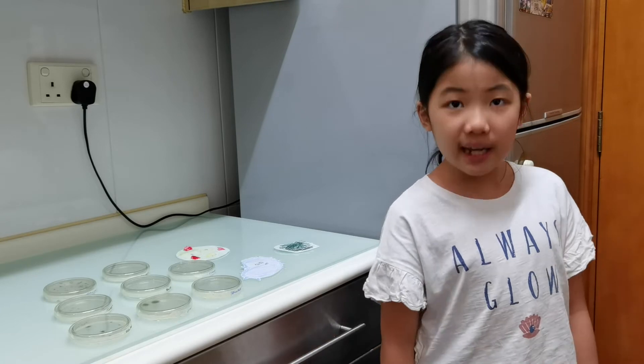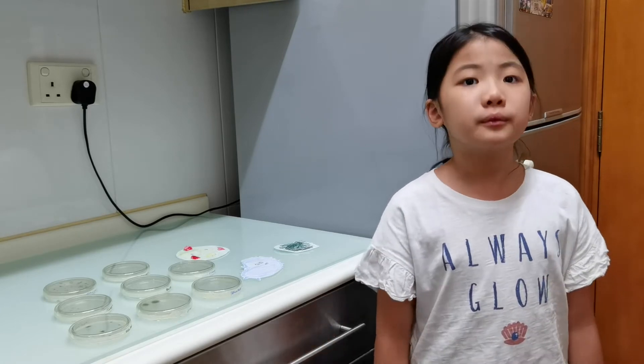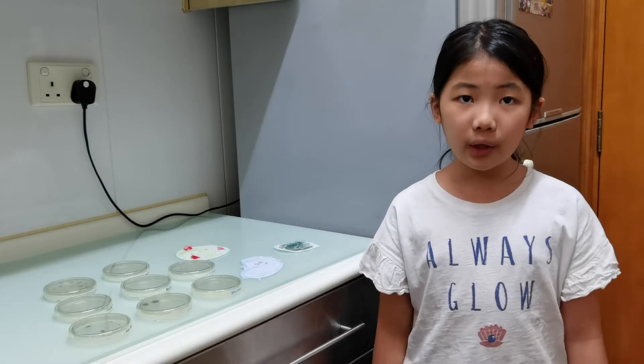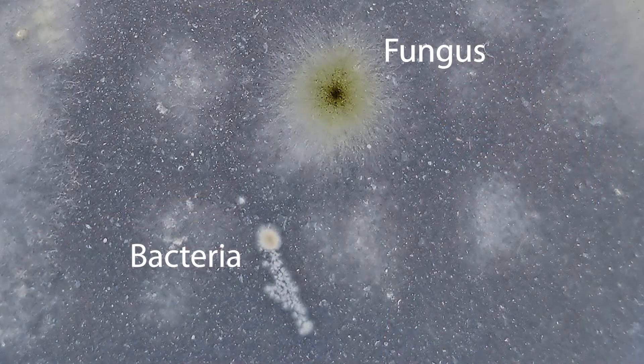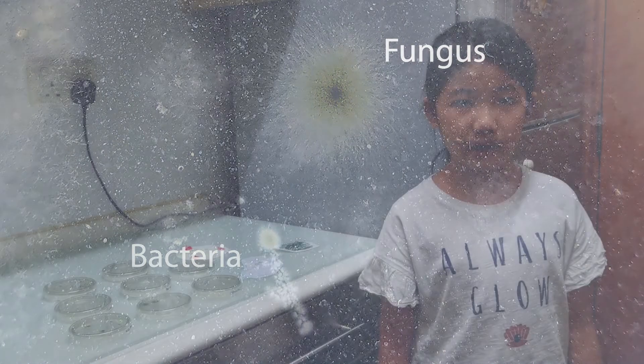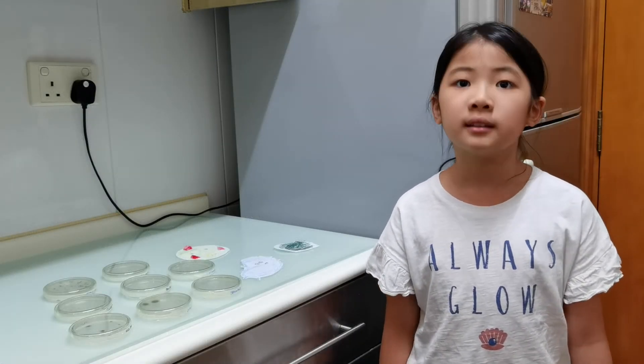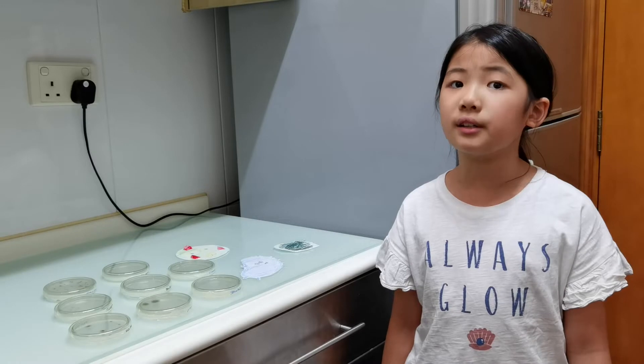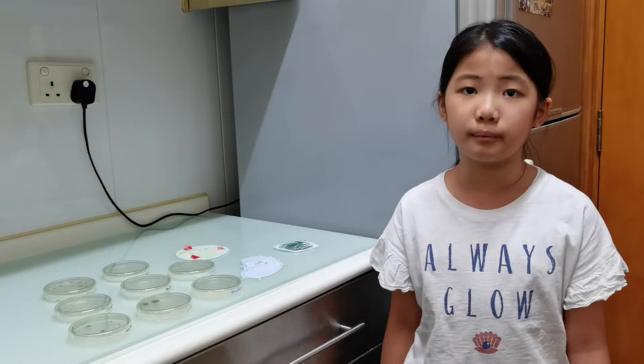Here's the result after day 6 of the experiment. For the iPad, there are two colonies of fungus and one colony of bacteria. One thing I noticed is that the fungi grows much faster than bacteria. Comparing the alcohol wiped iPad, it has no colonies at all. That proves the alcohol is very effective at killing microbes.